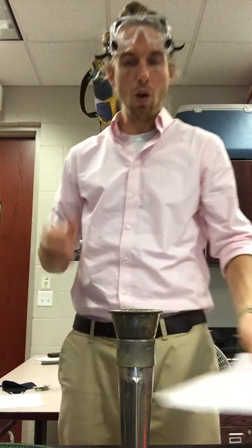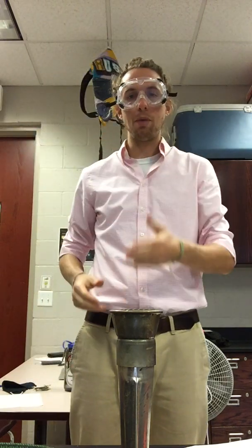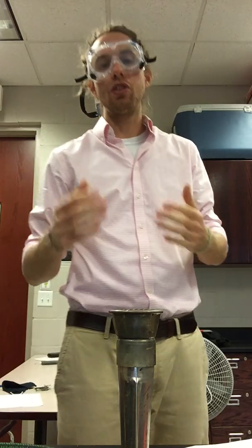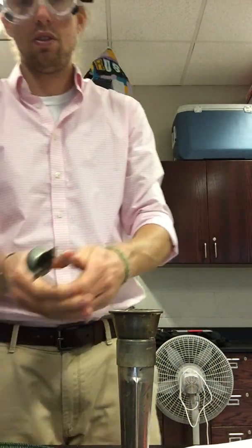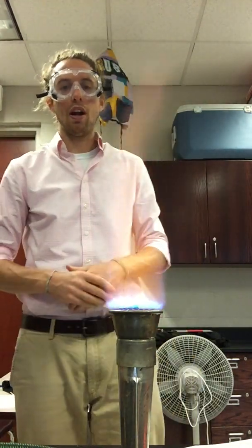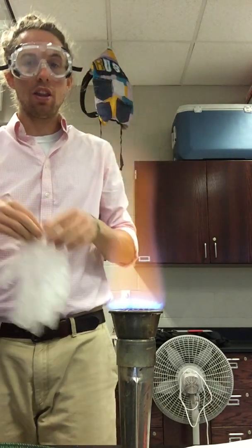To get things going, I am first going to start by putting on goggles, obviously super important. We're using a pretty large burner that you can see here. This is called a Fisher burner. It's actually a bit larger than a normal Bunsen burner. So I'm going to get that lit up. There we go. Our Fisher burner has been ignited.